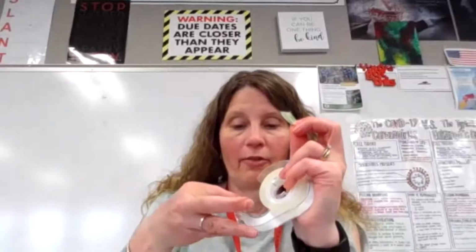So you want to peel this off, and you want to peel a little bit longer than what you actually need so that the portion you're touching has the fingerprints on it, but the portion you're not touching can be laid right on your fingernail polish. And so you're going to press this down as carefully as you can. You might want to use some lens paper to do the pressing so that you're not putting fingerprints directly onto your piece of tape. And then you're going to very carefully peel the tape off.